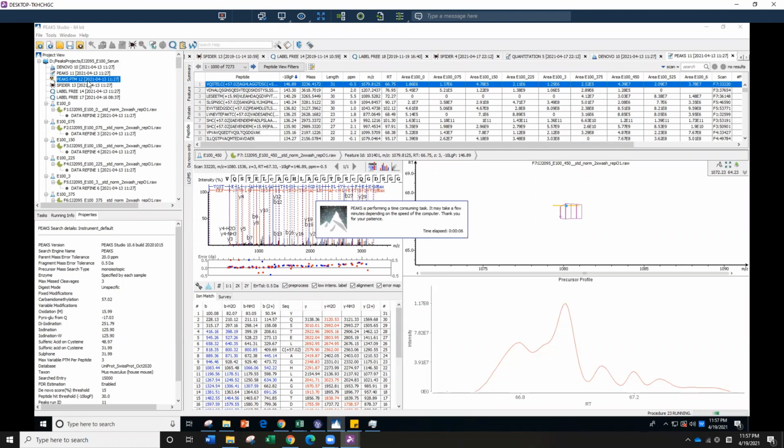Usually on a regular run, you're searching the 330 built-in PTMs. For my experiments, I'm only looking at some iodinated peptides. To reduce the analysis time in PEAKS, I only look for those for now. Later we might want to look for more. I want to show you the difference between steps.